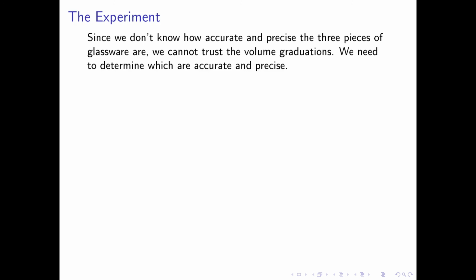This brings us to the procedure for our experiment. The entire point of this experiment is that since we don't know how accurate and precise the 3 pieces of glassware are, we cannot trust the volume graduations. We need to determine which are accurate and precise.